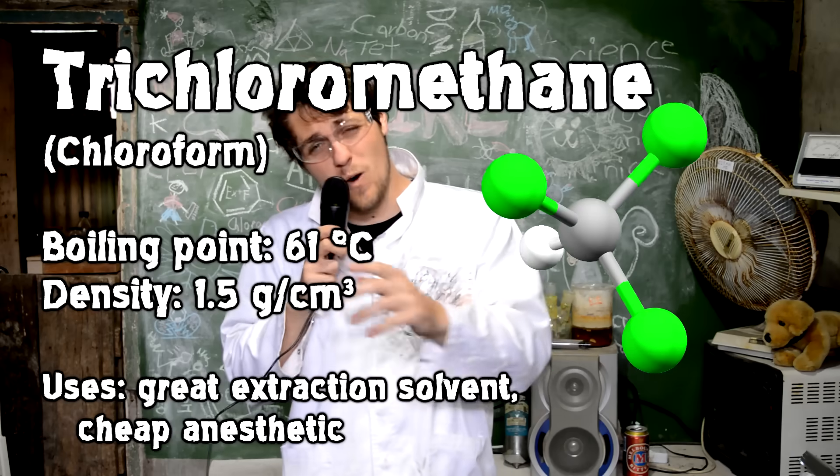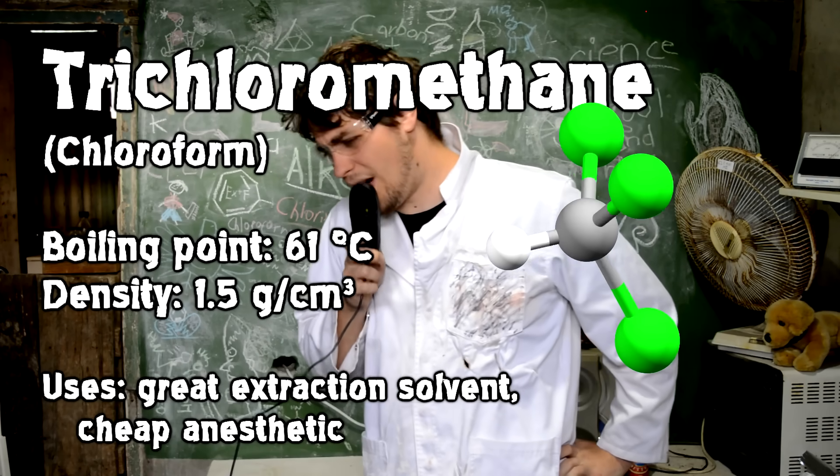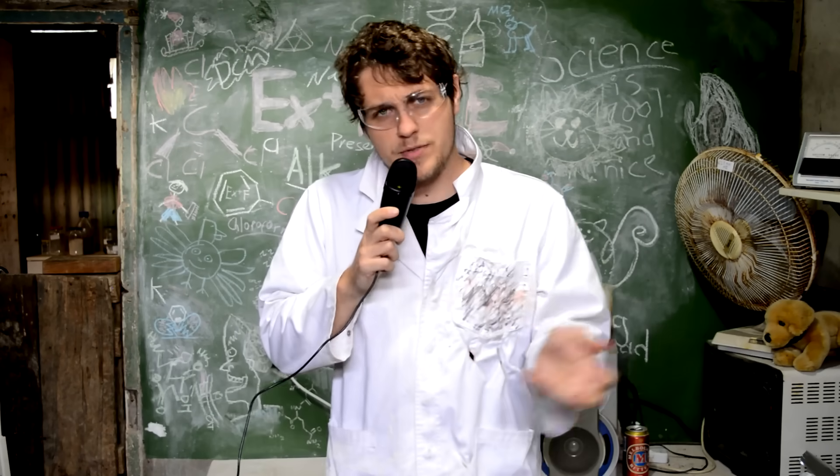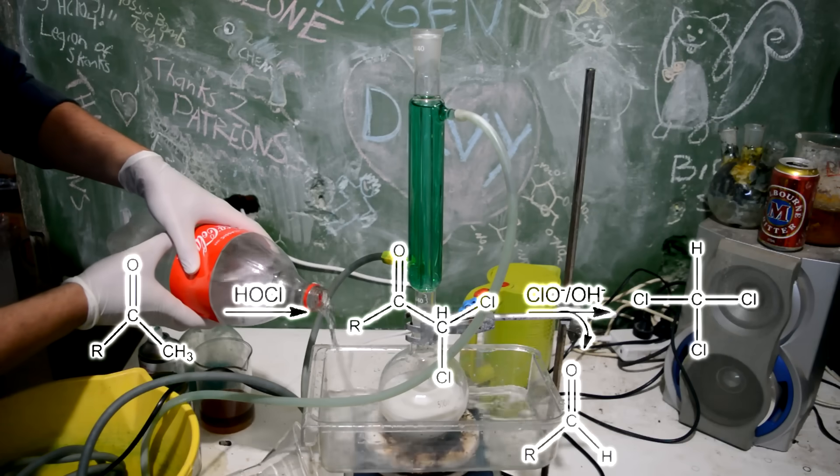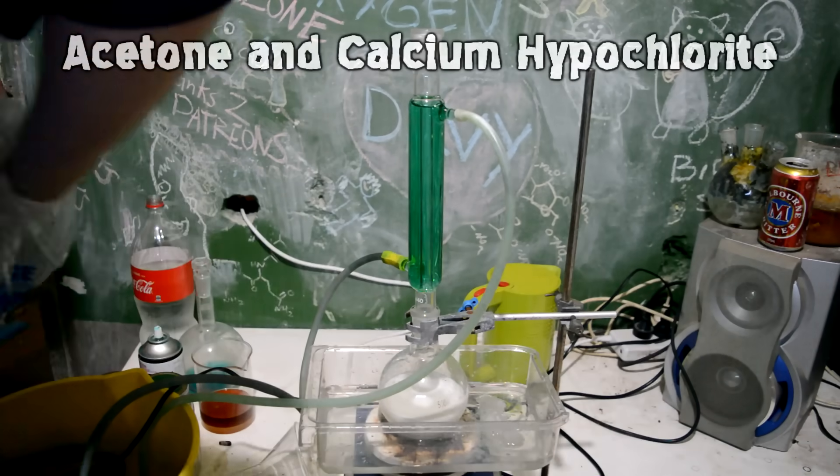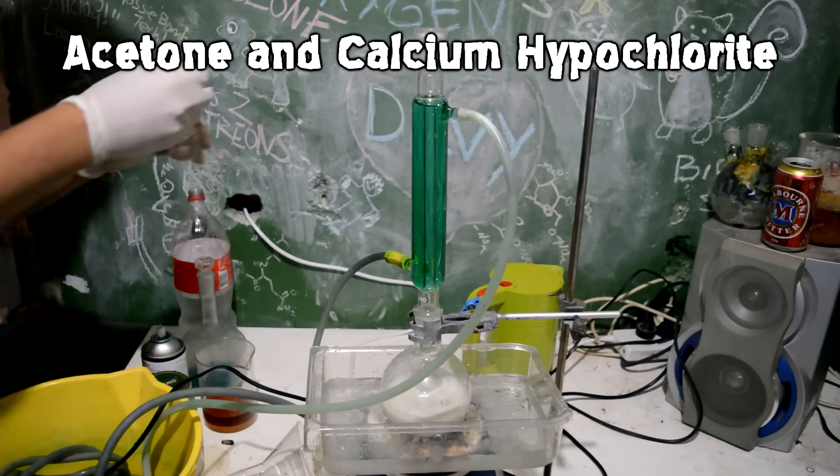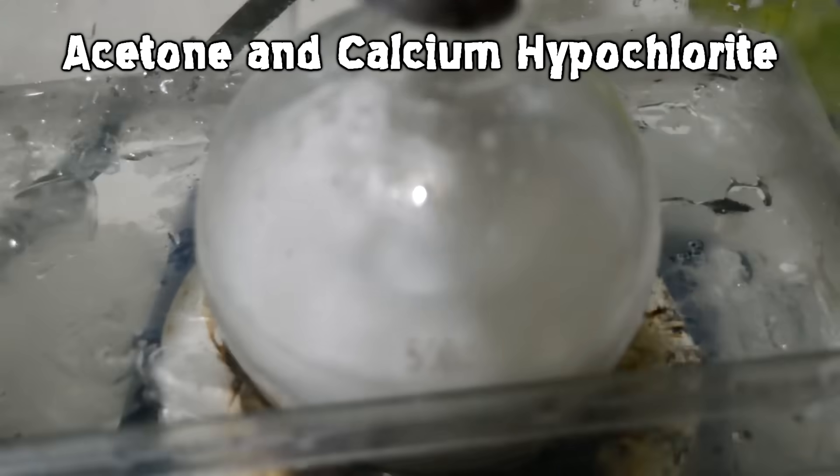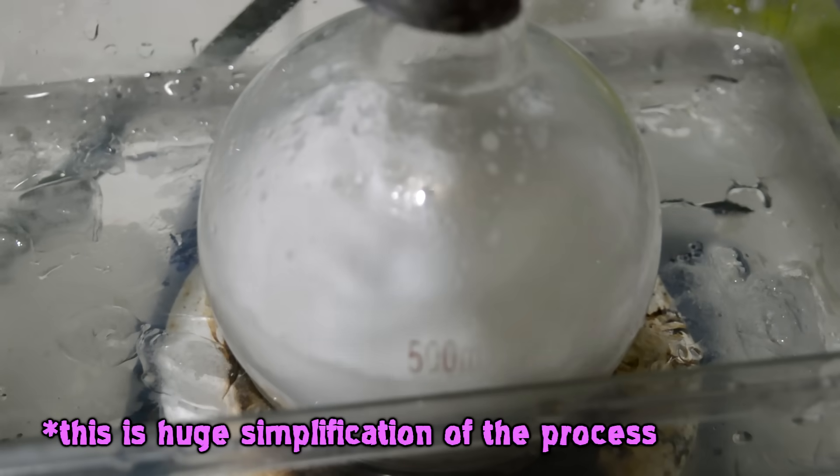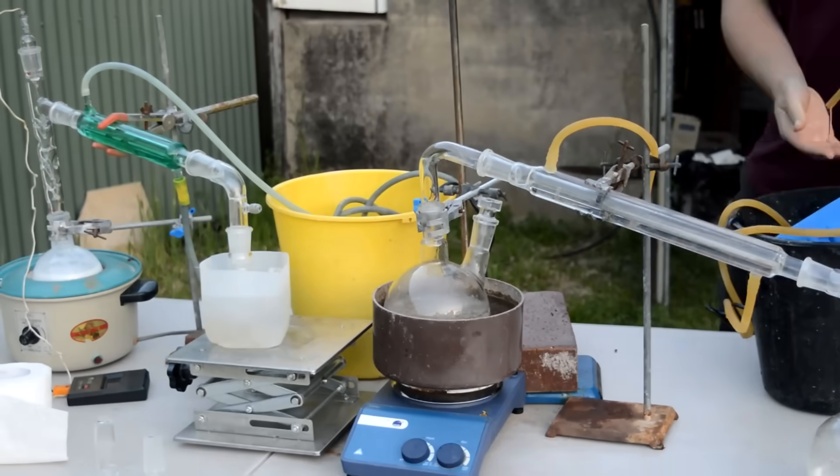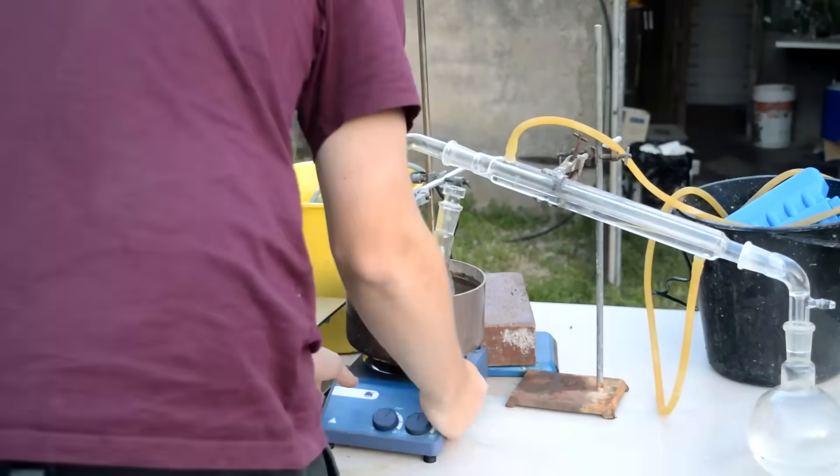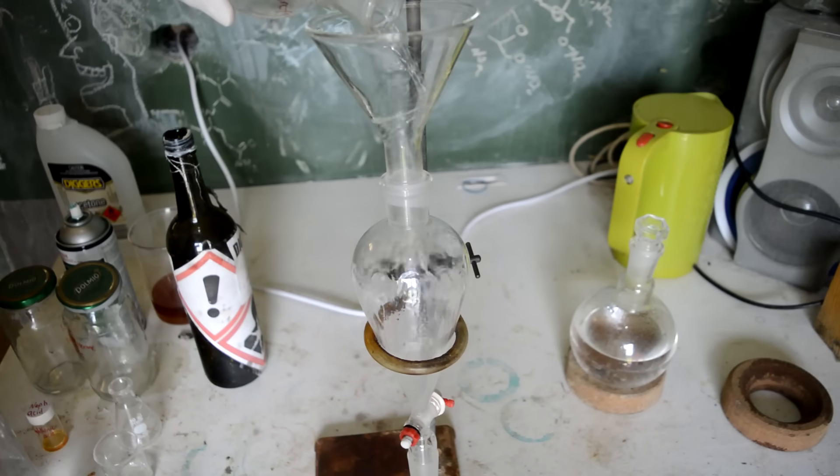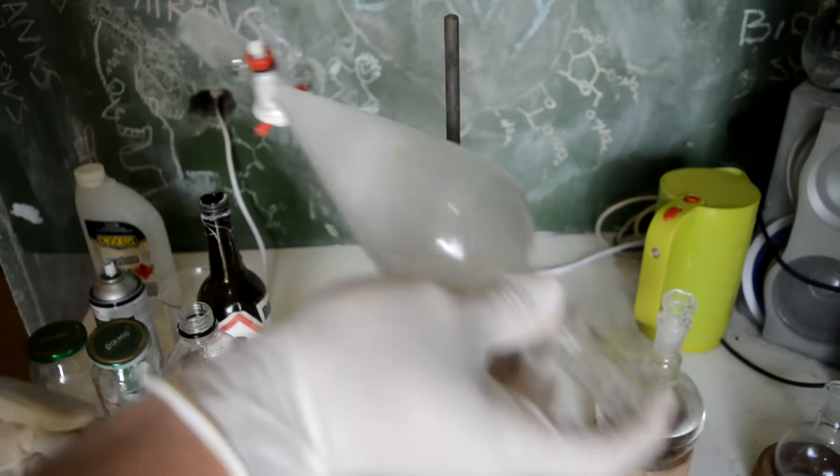Next up, we have trichloromethane or chloroform. Might not surprise you to learn that you can't just buy chloroform at the local hardware store these days. I'm sure you could in the 60s. But we do have to make it ourselves, which isn't particularly hard. We just need a ketone and a hypochlorite. Which sounds very complicated, but really we just get some acetone and some pool chlorine and mix it together.